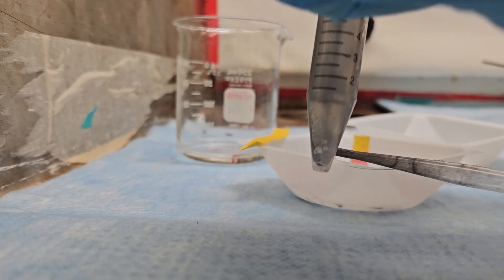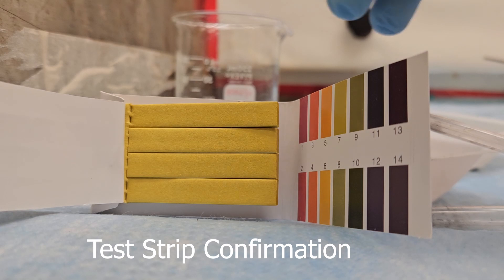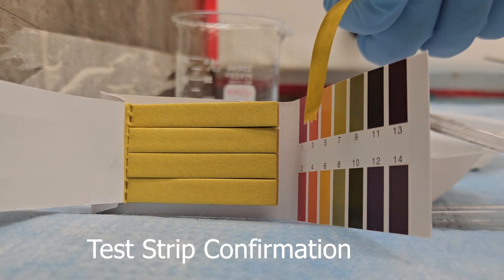After washing three to four times, test the pH level of the supernatant, and ensure that its pH is between 6 and 7, as seen here.